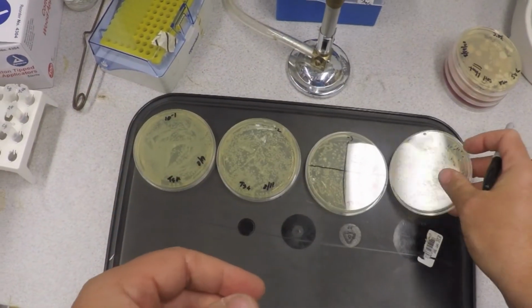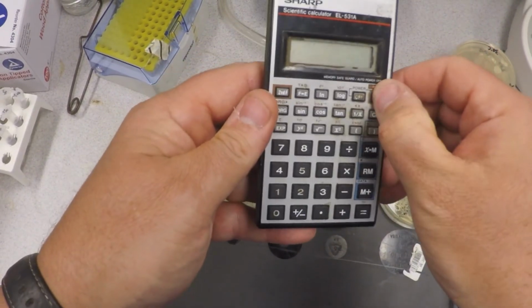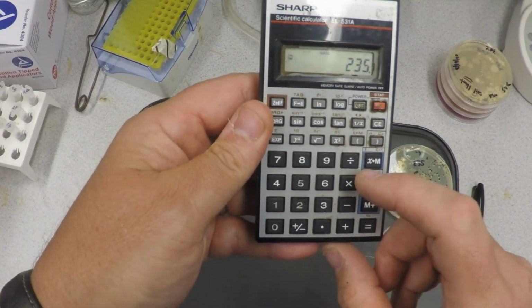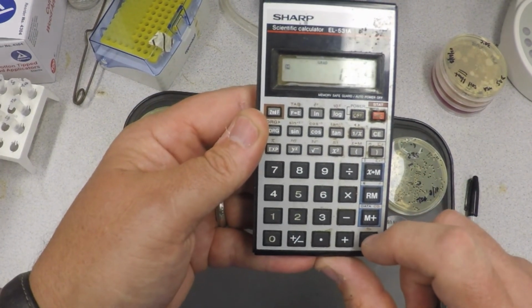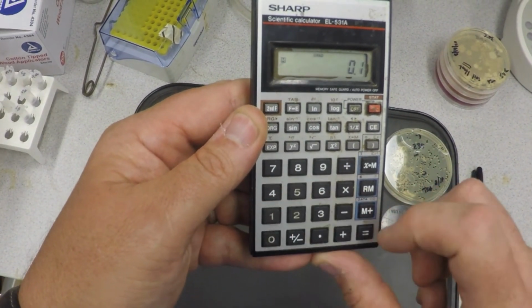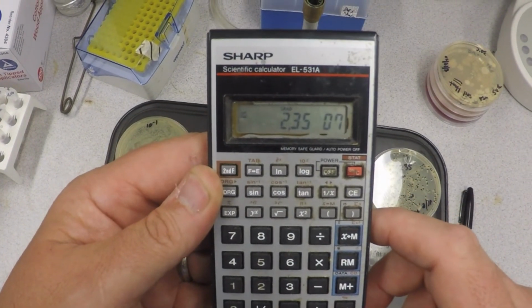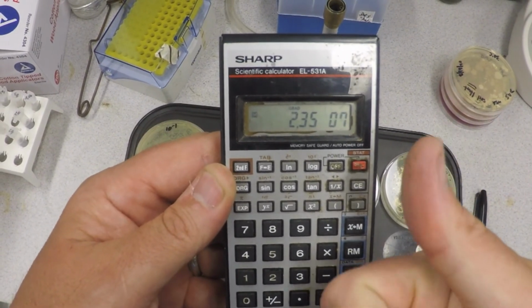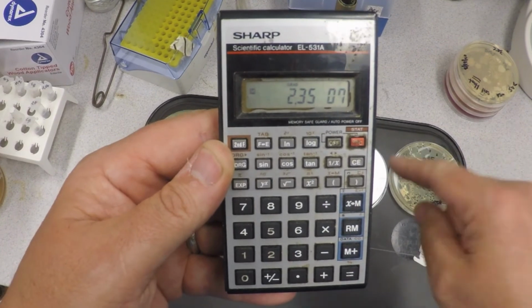Okay, so let's see. That means I got 235 CFUs. I multiply it by my dilution, which is 10,000, and I divide by 0.1, and I put it into notation so that we scientists can understand it. And I get 2.35 times 10 to the 7th cells per mil. Okay? Fantastic. I believe it. This is looking at live cells, and every single colony is an individual cell.